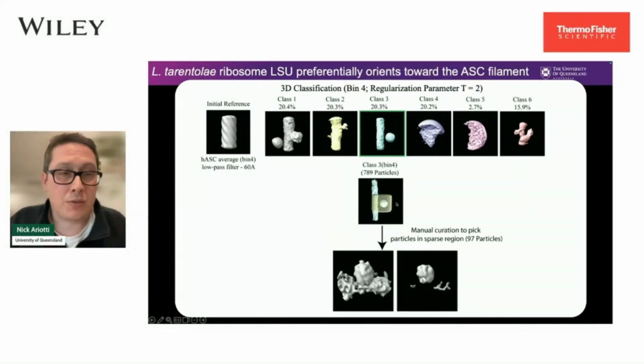Unfortunately, it just wasn't possible. So we went through a more curated approach. We picked out 100 particles, and we looked at the structure of what we could resolve from those 100 average particles. And what we saw was quite interesting.